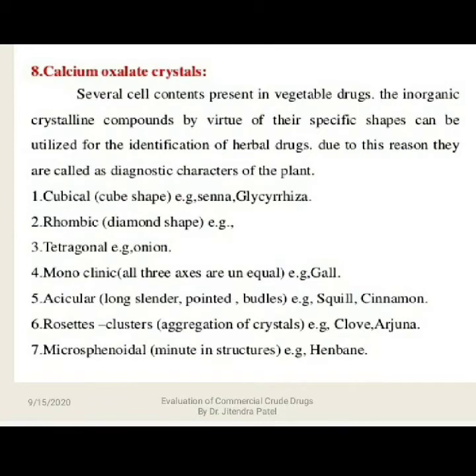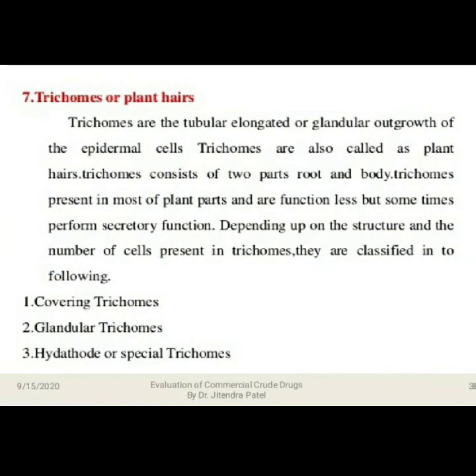Microsphenoidal, it will be minute in structures. So in henbane seed, like that, different types of calcium oxalate crystals will be there in different drugs. So that will be considered as a diagnostic character of the plant.